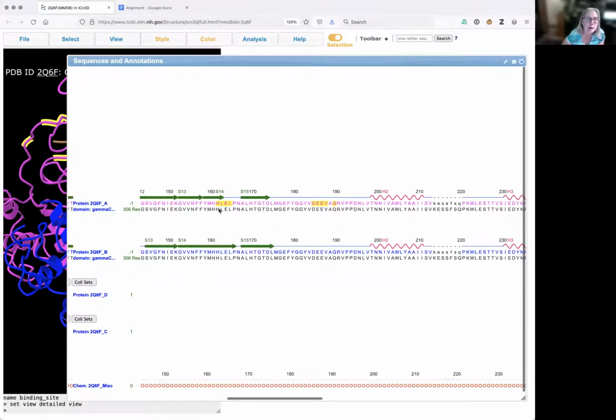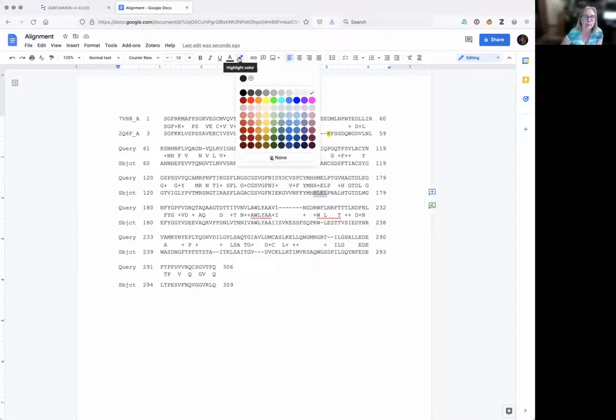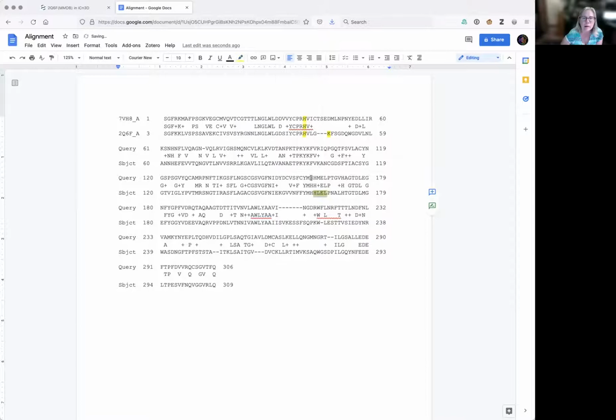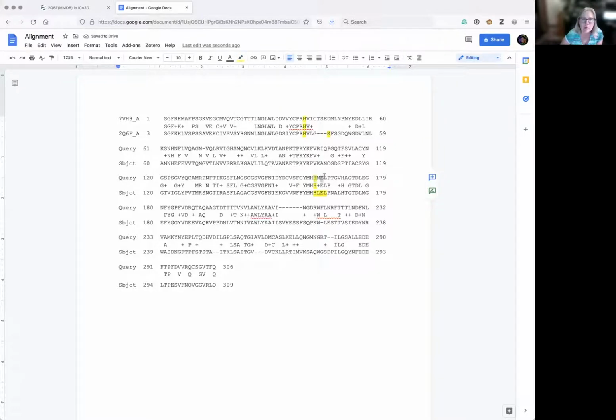Okay, I've got an HLEL here that begins at histidine 162. So let's take a look here. We're looking for HLEL around 162. And I can see it right there. Now I can see that histidine 162 is present in both of my proteases, as are the glutamic acid and the leucine.